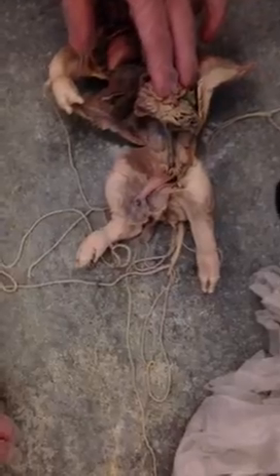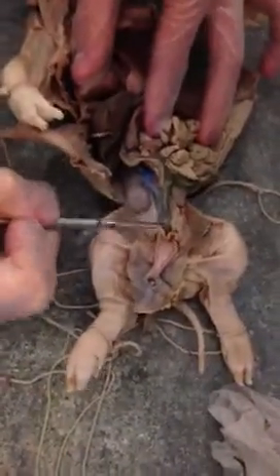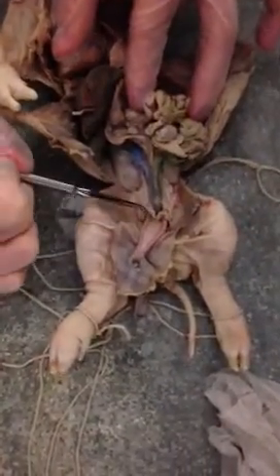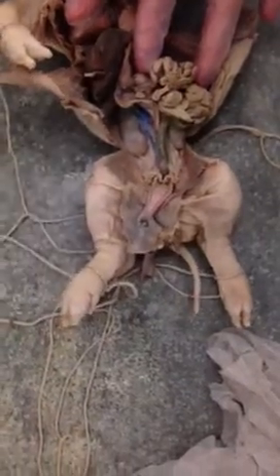Finally, we're going to go through the excretory system, which we kind of already did, but I'll just do it again. So here's the kidneys, which go through the ureter, which is kind of hard to see, but they're these faint little squiggles that run down that go into the urinary bladder. And yeah, that's it. Can we do the heart modifications?